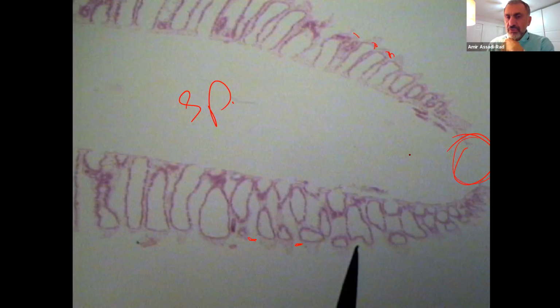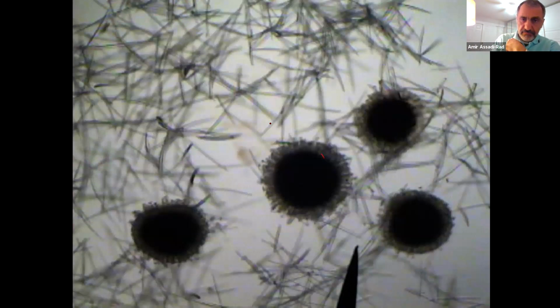These are gemmules, phylum Porifera, right here. And these are spicules. These are all spicules, and these are gemmules. The name of this organism is Leucosolenia, and the type of canal is asconoid. And this structure right on top is the osculum. The type of canal system is asconoid, the simplest type of canal, you already know about it. And phylum Porifera, what else? Class Calcarea.